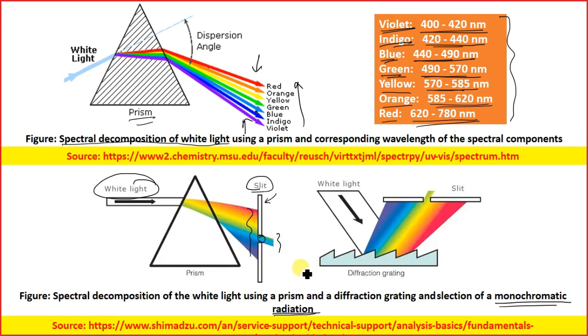So you have to be very careful while choosing the width of this slit. Smaller the slit, the more refined the monochromatic light, but if you go below a critical level, there will be diffraction of those rays and you will not be achieving your goal.